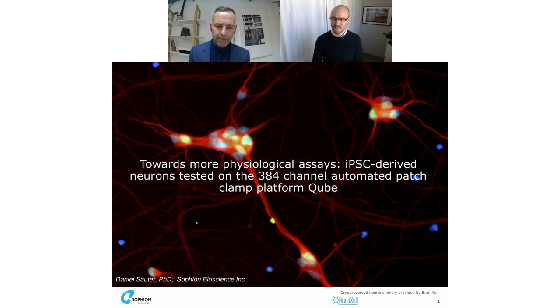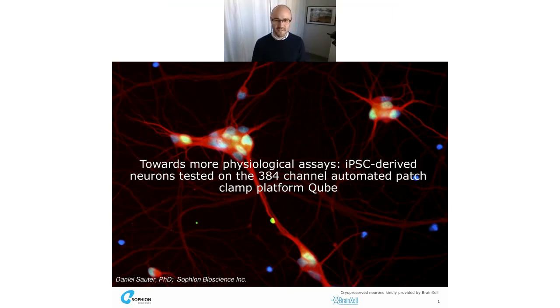Yeah, thank you very much. I'm excited to present some data today about a very fruitful collaboration that we had with BrainXell, where we really looked at these cells and characterized them on our 384 automated patch clamp platform. So I am going to address both of these questions throughout my presentation. So I'll leave it with that. And in case I forget along the line, maybe you could bring it up at the end again.